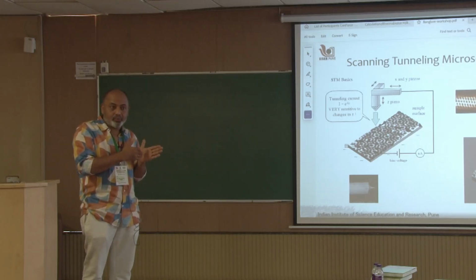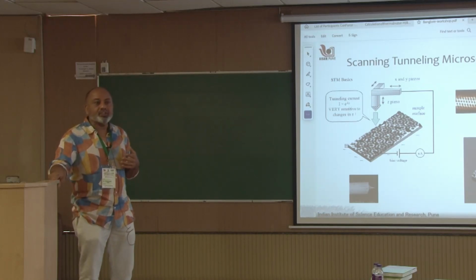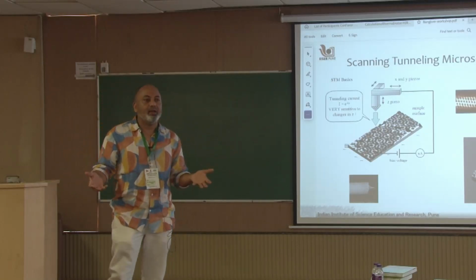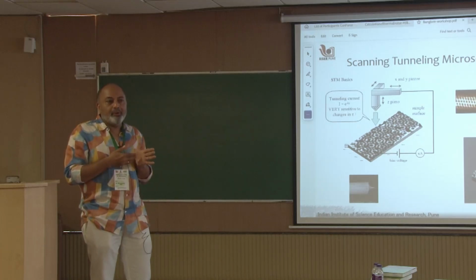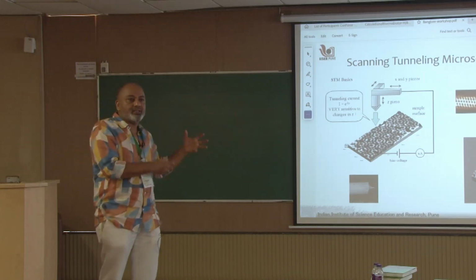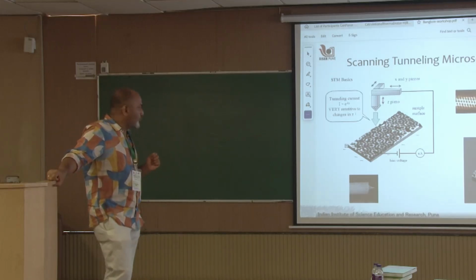This is a hard thing to do, because as I am talking, this table is shaking by microns because of my talking. I walk around and this room is shaking by tens of microns. And what we are talking about here is holding a tip about an angstrom or two away without touching. That means all this vibration should not reach the junction where all this is held together. So this is quite a hard thing to do.